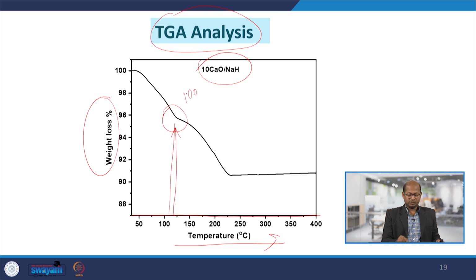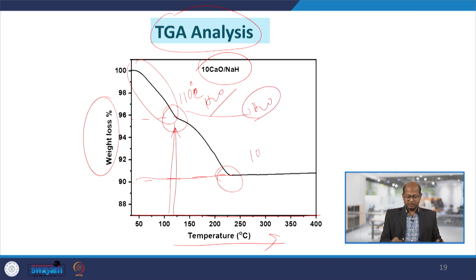It may be due to weight loss of water, the water present in the sample. So H2O gets removed.